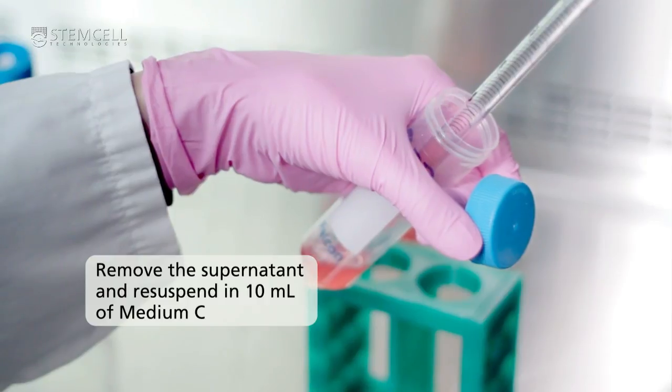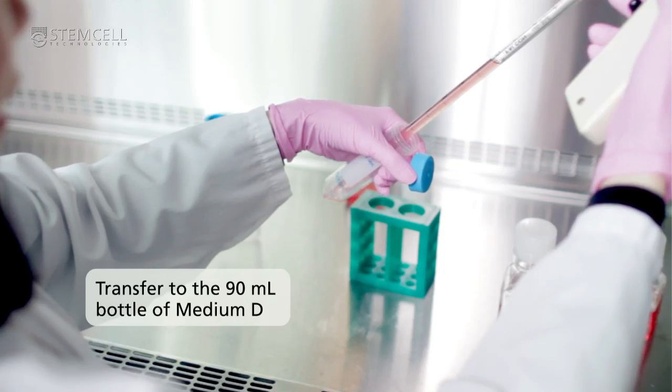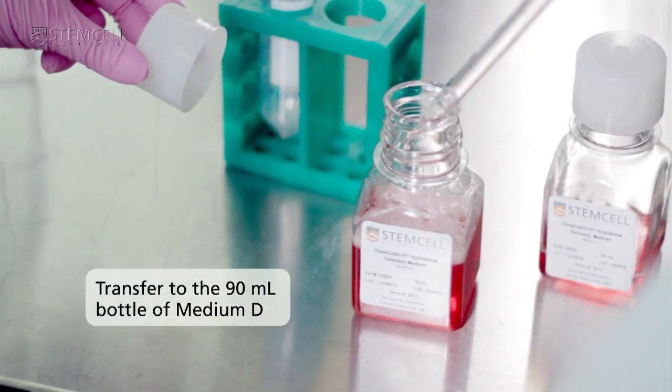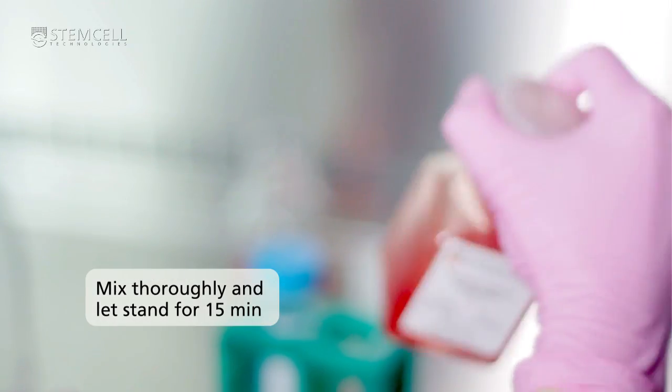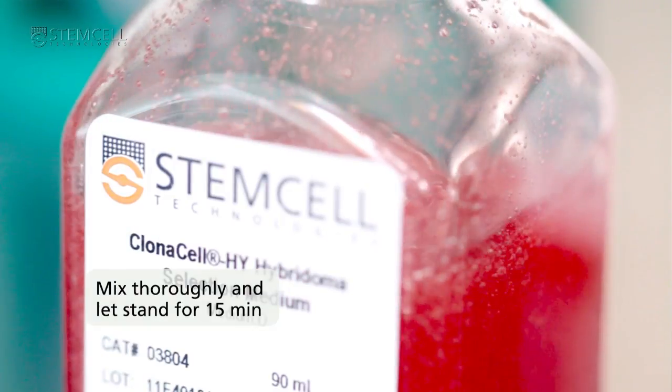Transfer the 10 mils of cells and medium C into the 90 mil bottle of medium D. Mix thoroughly and let the bottle stand for approximately 15 minutes so the bubbles rise to the top.